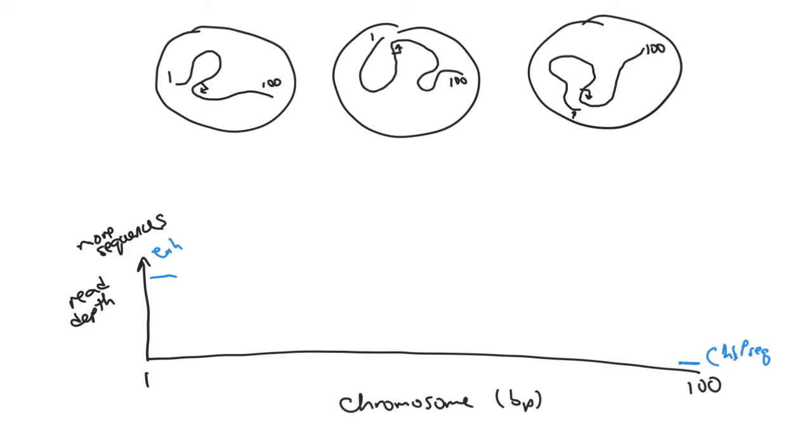And then it would drop off, because as we move away down the chromosome, this is probably, in ChIP-seq, heterochromatic if it's not containing a gene or an enhancer. So we would see that for the next part of the chromosome, there's very little sequence that comes, maybe none, maybe very little. And then once we reach the transcription start site and the promoter, we'll see that spike. And maybe we'll see spikes for exons that are in euchromatin, and then it will drop off again.